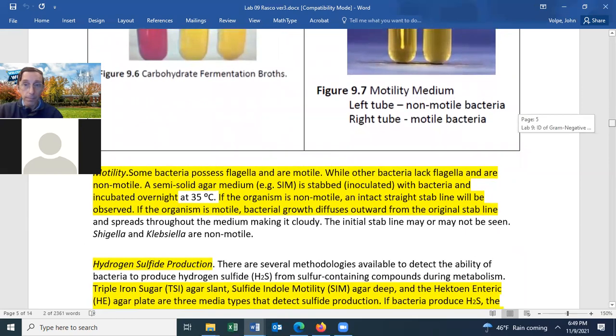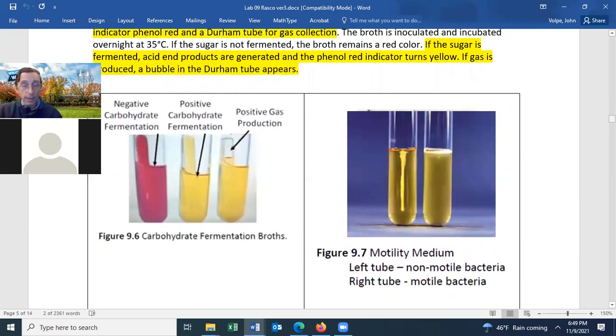All right. All of the Enterobacteriaceae family members can ferment the sugar glucose. Not all of them ferment producing gas. Some of them ferment and are acid only. Others are acid and gas. Pseudomonas aeruginosa will be negative for the carbohydrate fermentation test. I should say glucose fermentation test.